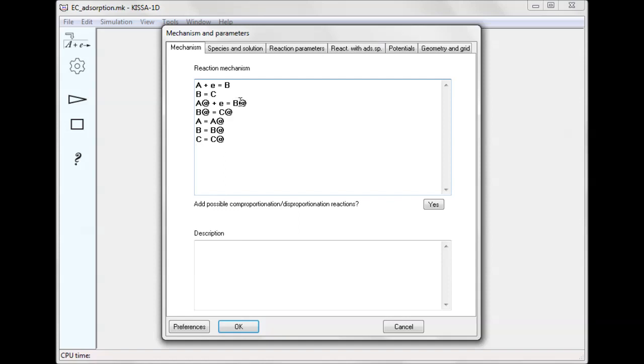In KISA notation, adsorbed species are denoted with the at sign following a species name. For each adsorbed species, an adsorption-desorption step must be defined as you can see in the last three steps of the mechanism.